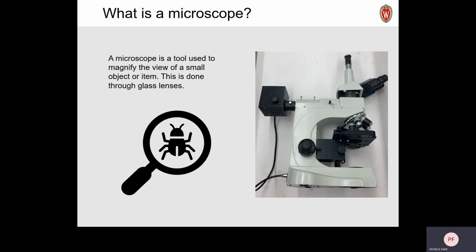And what you can see here on the right is a more common microscope that's found in labs. On the left, they have a light, and then they have an eyepiece up top, and that all shines down towards the optics, where you actually set your sample down on this black plate. You have optics where you can choose your magnification, and you can observe whatever you want to look at that's too small to view with the naked eye.